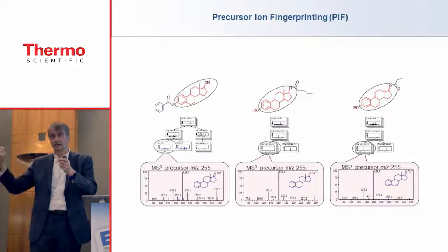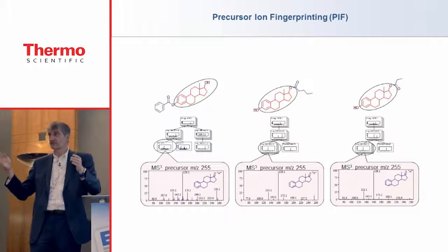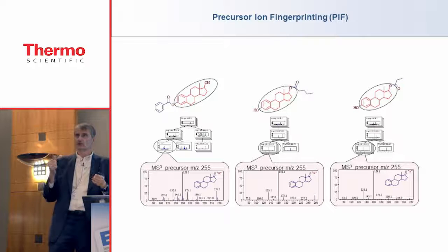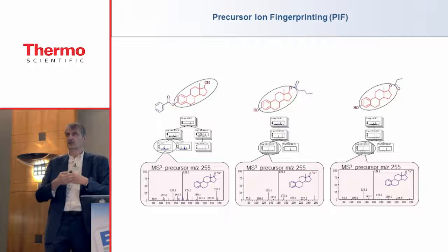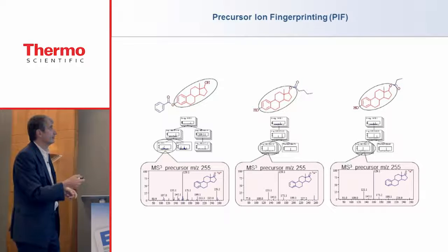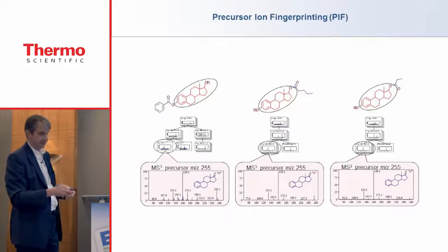So once we isolate a fragment and do an MSn spectrum, we will always get the same spectrum. Not the same, so I would rather say matching spectrum. The only thing the ion remembers is its internal energy, and we can compensate for these internal energies by using spectra acquired at various collision energies. So if this one were unknown and those were in a database, we could at least identify the substructures based on these spectra.